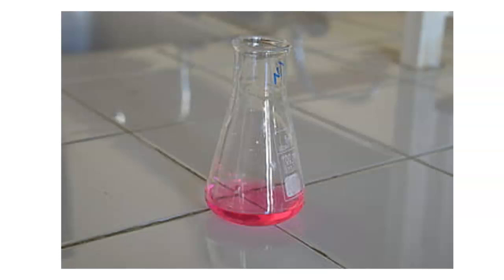So that's what we're working with. Phenolphthalein is colorless below the pH of 8.0, right? But it turns pink when the pH is 8.0 or higher. Just to throw that in there for you, that way you have an idea going into it what we're talking about. So the fainter the pink color I was just talking about, the closer to the equivalence point.